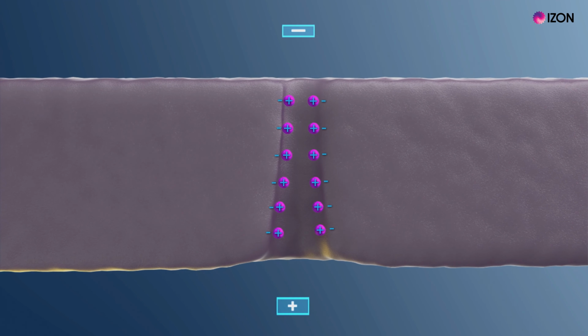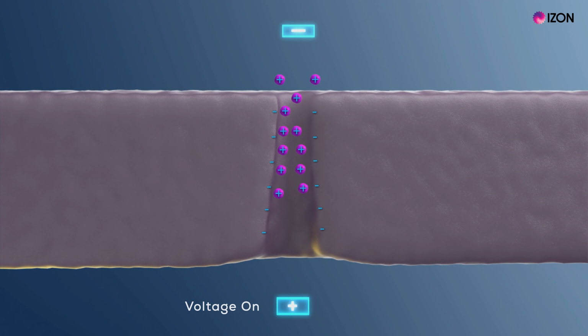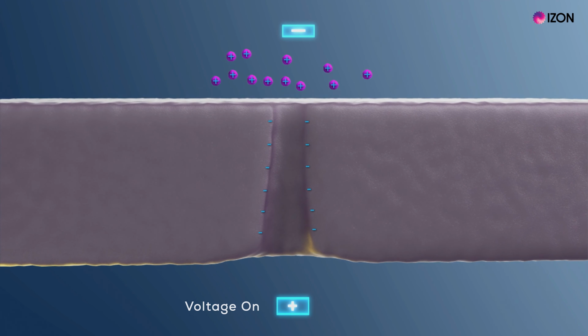Electroosmosis is the motion of a liquid in an electrically charged channel induced by an electric field. Most materials acquire a surface charge when exposed to a liquid, and a so-called electrical double layer forms at the solid-liquid interface. Applying a voltage across a channel or pore results in a fluid flow parallel to the channel walls. The direction of the flow is determined by the sign of the voltage and the sign of the surface charge. Microscopically, the fluid flow is due to the mobile ions in the double layer experiencing a force due to the electric field and consequently dragging along the surrounding water molecules. So, the cause of the electroosmotic flow is the Coulomb force between the ions and the applied electric field.